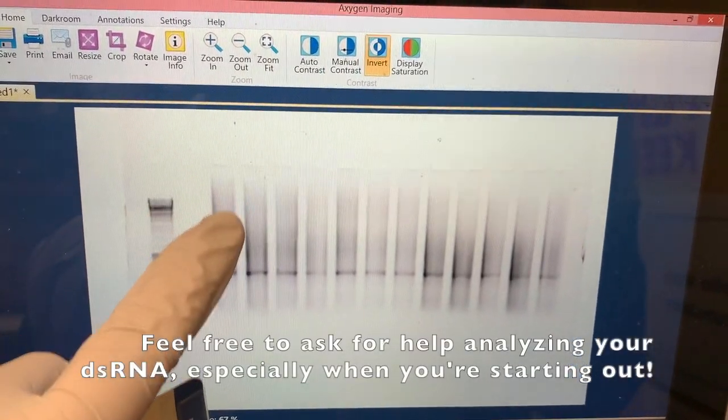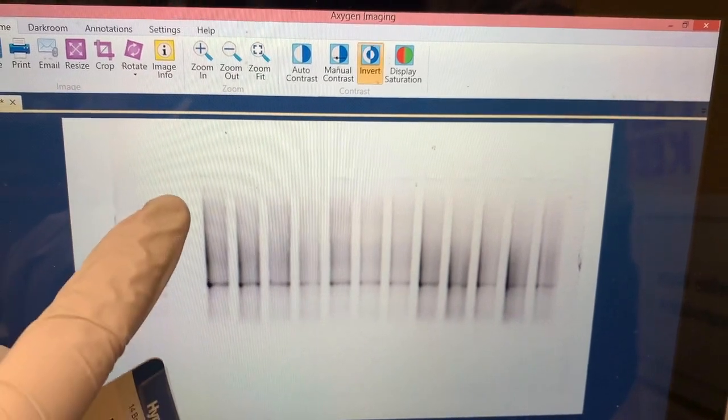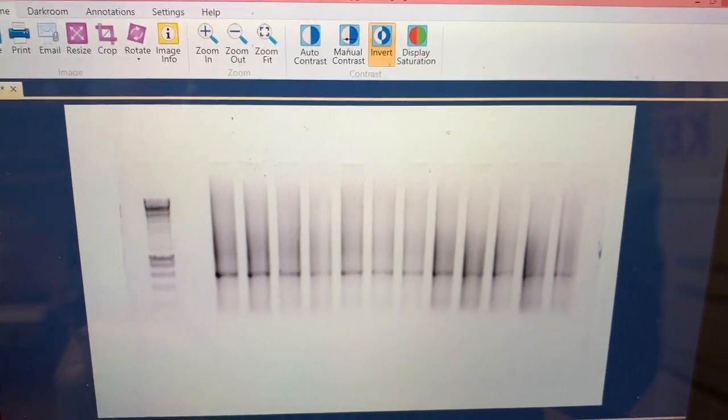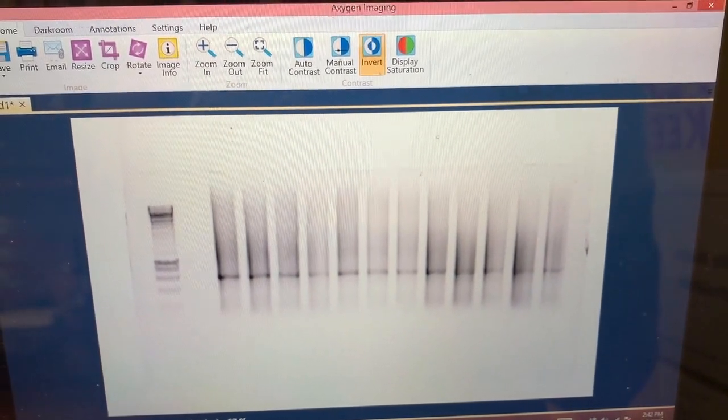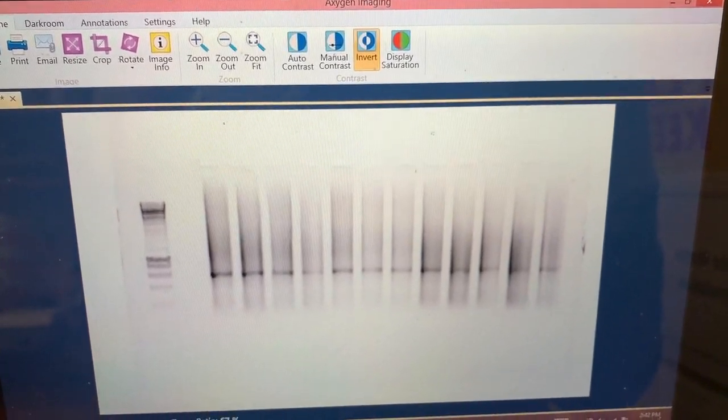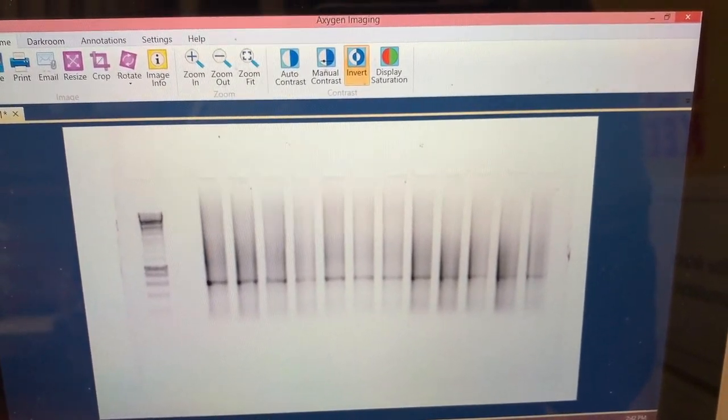And you'll see that there's some smearing. This is where just not all of that RNA anneals properly. And you can re-anneal a little bit. Sometimes you'll have a stronger single band than this, but a little bit of that smeariness is normal for double-stranded RNA.